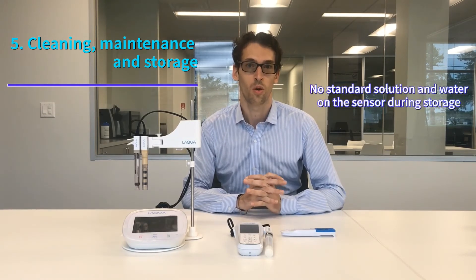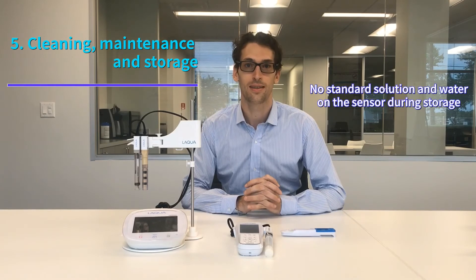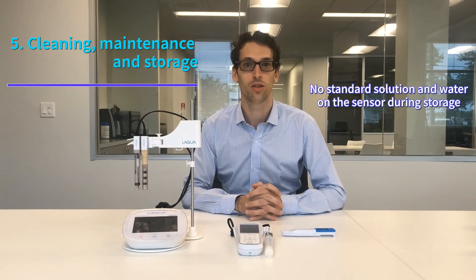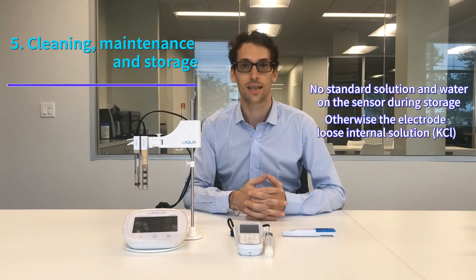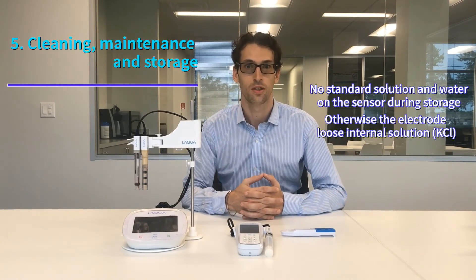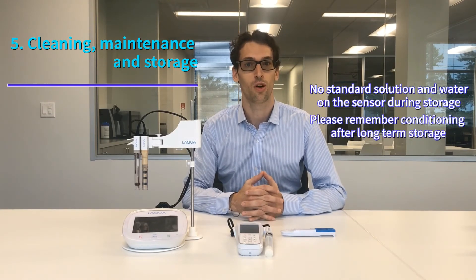When it comes to storage, it's important to store the meter dry — no standard solution, no water on the sensor during storage. The reason is simple: underneath the pH membrane there is an internal solution made of KCl, and this solution diffuses into any liquid left on the sensor. So if you store the meter with water, the internal solution will diffuse into the water and reduce the lifetime of your electrode. Store the meter dry, but after storing it for a long time, remember that electrode conditioning is critical.